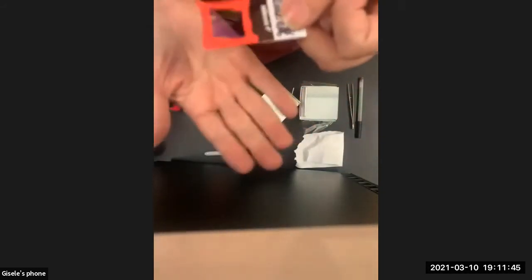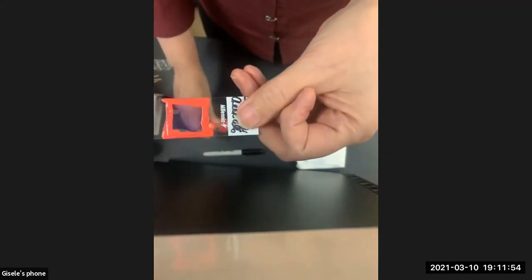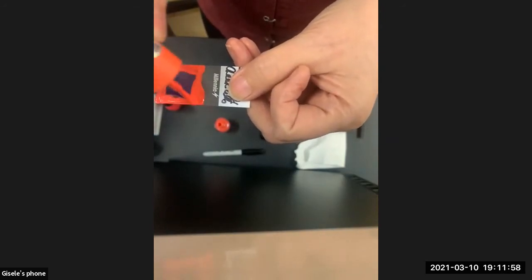And then if you're like me, you blow on it or wave it around because you're impatient. You're like, hurry up and dry. If you have a nearby nail salon, I always want to get one of those machines that you stick it under and it cures it real fast. But anyway, in 2 or 3 minutes, when it is dried, you should go back and put another coat.